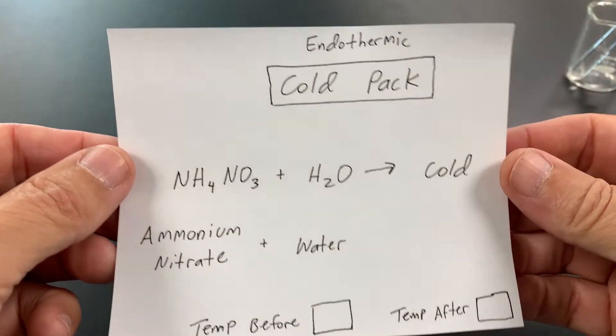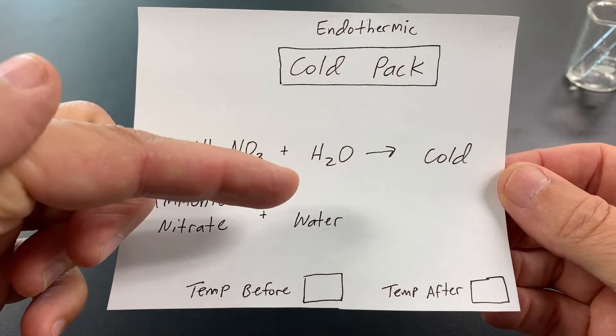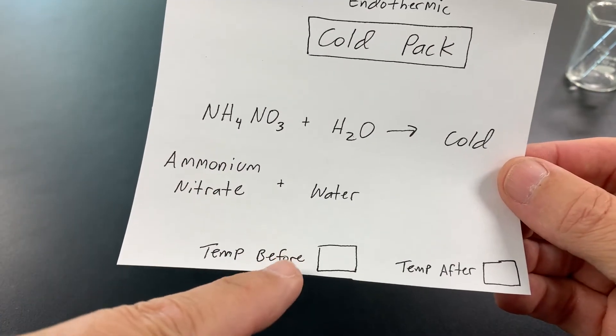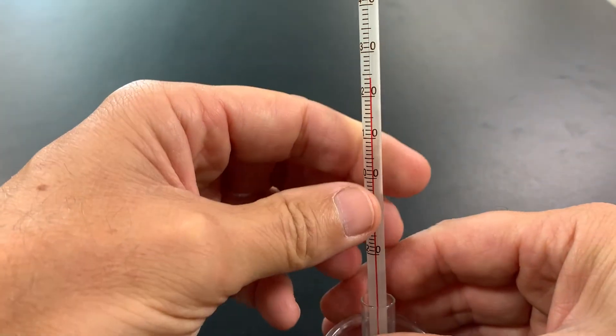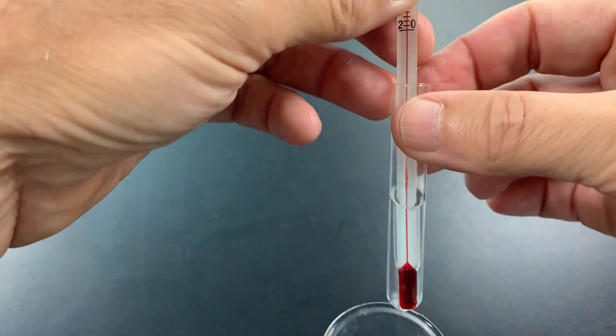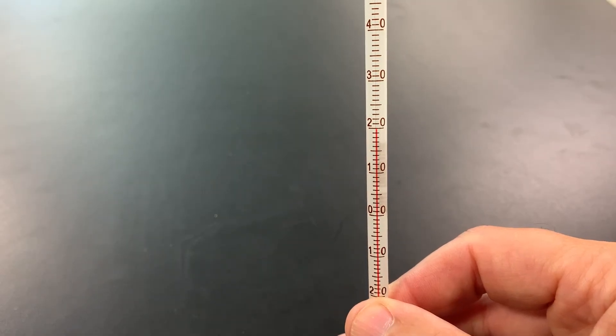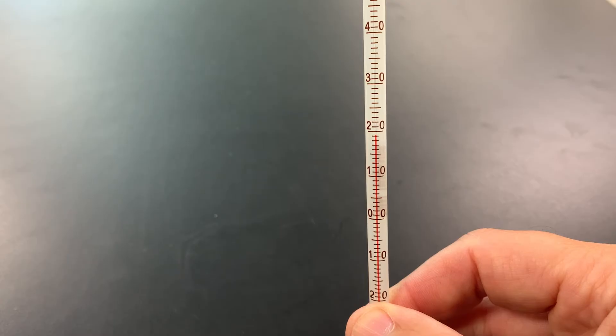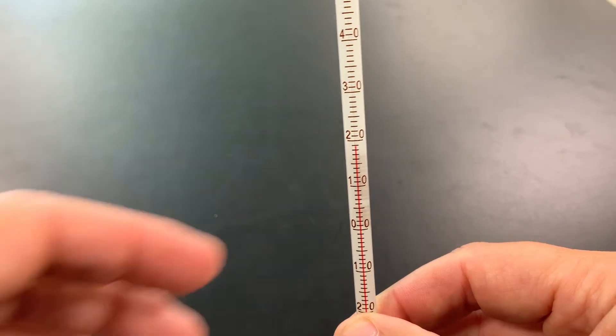Now let's do another reaction. This one is going to be cold pack. This one is endothermic. In this case, we're going to do ammonium nitrate with water, and it's going to get cold. Let's take our temperature before. So, I've got a new little beaker, and I'm going to put the thermometer in. You can see it's dropping rapidly. We're measuring the temperature of this new water. It looks like it's at 19 degrees Celsius. I'm going to write that down.